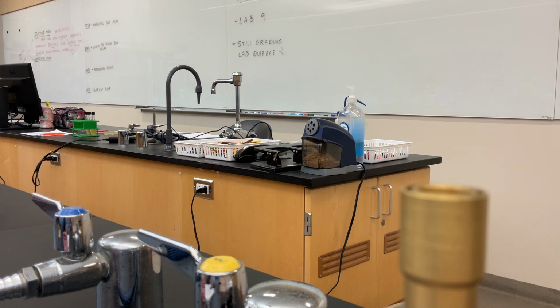Now we also can have differential media. Differential media is when we see a visual difference between similar organisms.